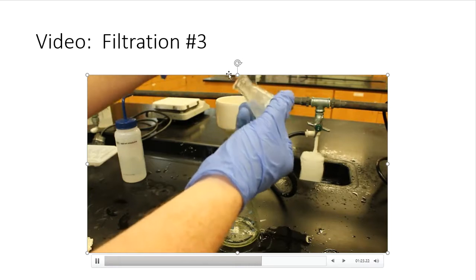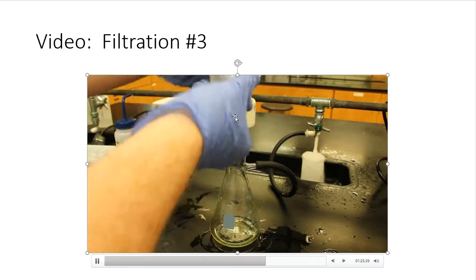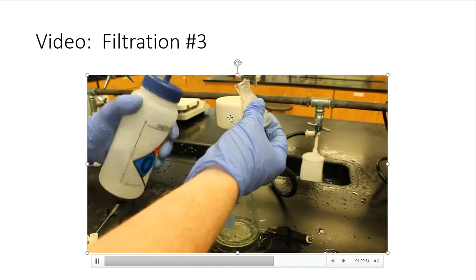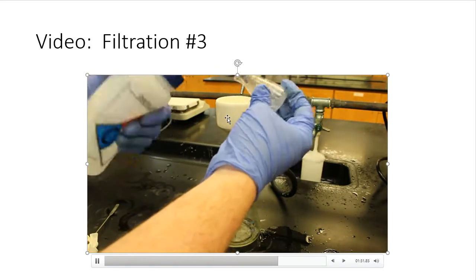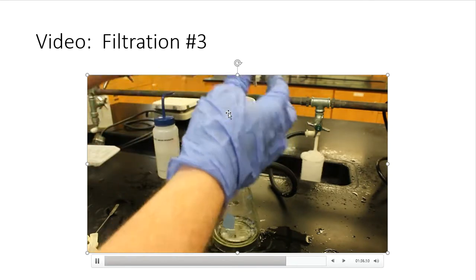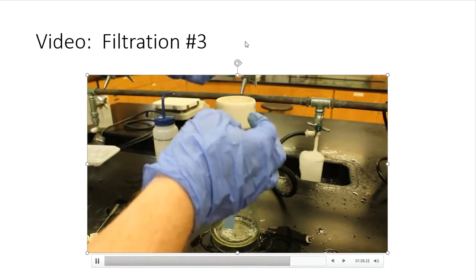Notice again, folks, that this flask is already pretty clear, and there's no really color left in there at all. I'm just trying to loosen up some of the stuck crystals on the sides in order to transfer them over. That's the only thing that I'm doing here in this step.